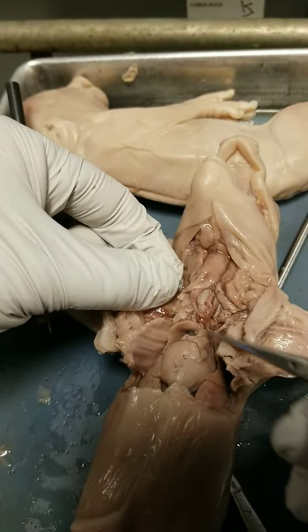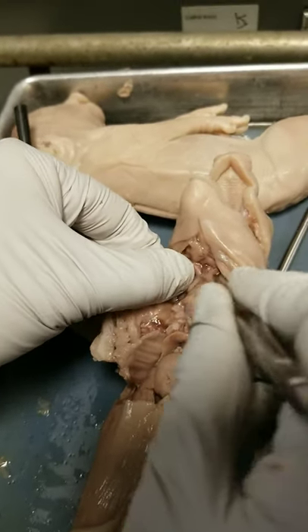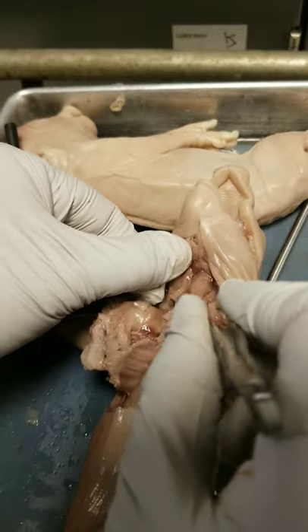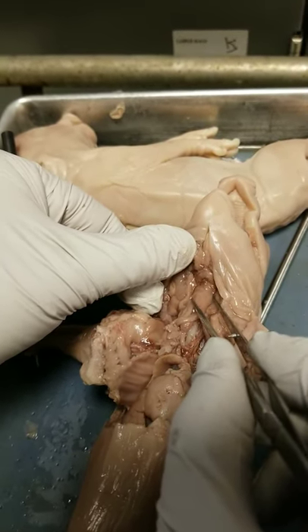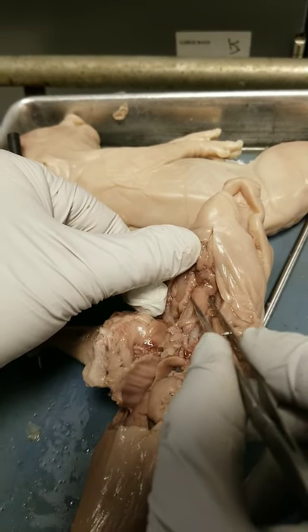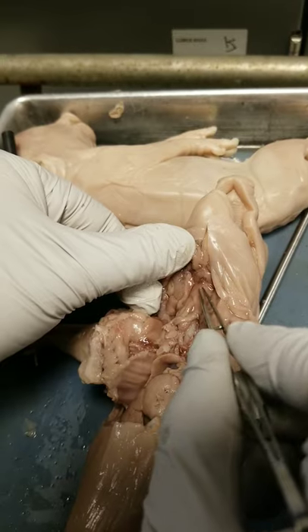Back to the trachea — the trachea of course leads to the lungs, but if you follow the trachea up, it leads to a bulge here. This bulge is the larynx, L-A-R-Y-N-X. This is where your voice box is, where the Adam's apple is — that cartilage protruding part of your neck.